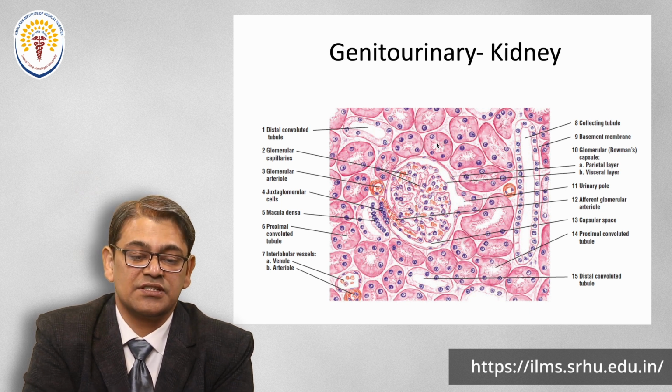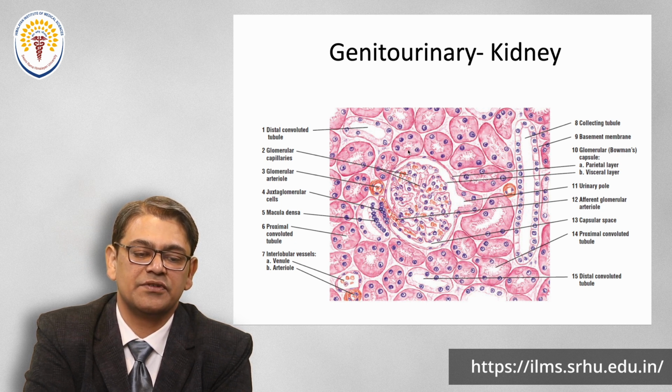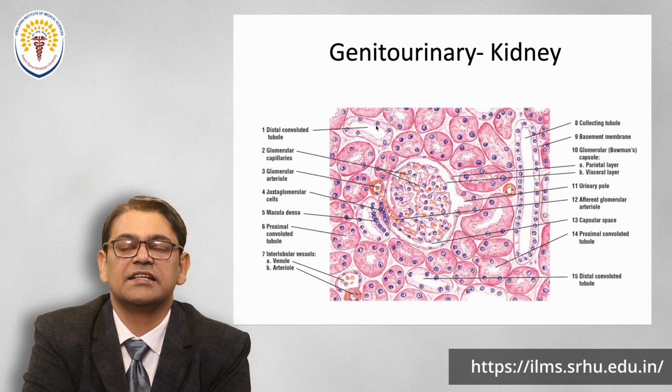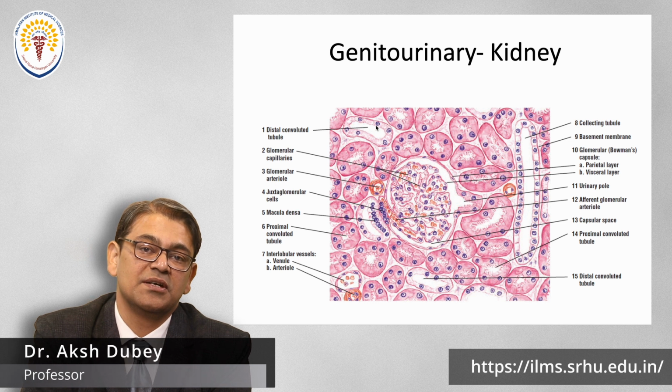In kidney histology, if you already know this, then you can know that this one is the proximal convoluted tubule, and this bigger lumen and lighter staining is the distal convoluted tubule. Now refer to your books again.